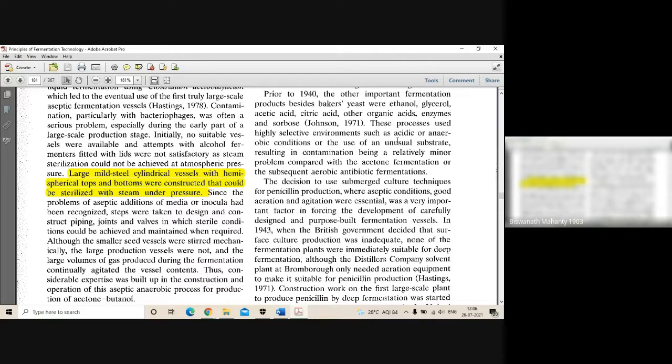So basically, when I am talking about a lab scale or moderate scale reactor, if it is small scale, we'll use glass, okay, we'll use glass. If it is a moderate size and you need a more rigid material, we can use stainless steel. So stainless steel and glass, these two are the basic configurations we can have. Sometimes a reactor can have the top plate and bottom base made of stainless steel. Other components are essentially made of glass. So a glass plus stainless metal formulation is there.